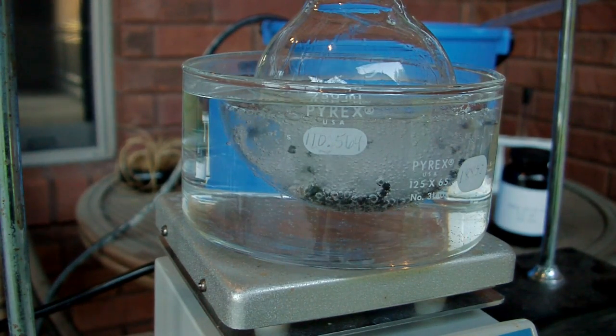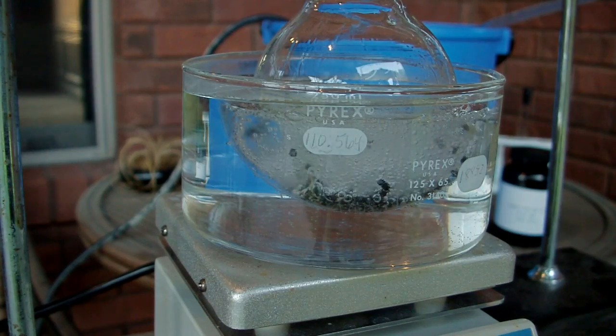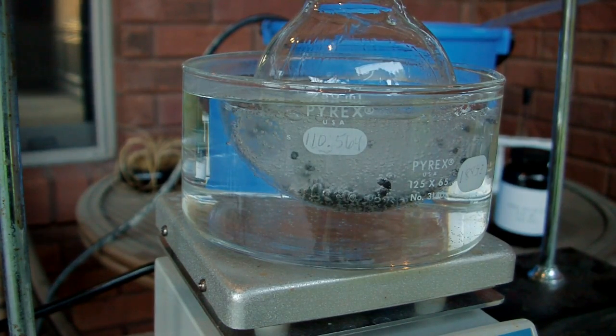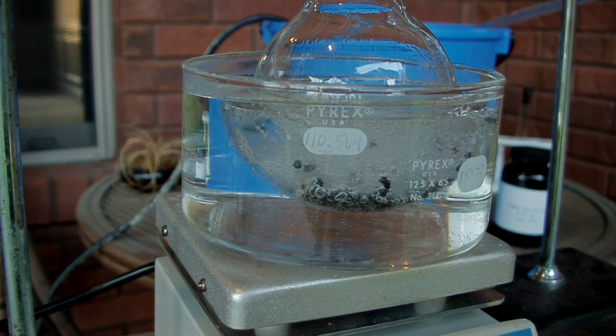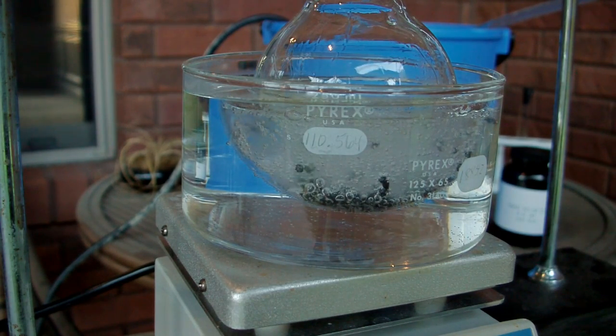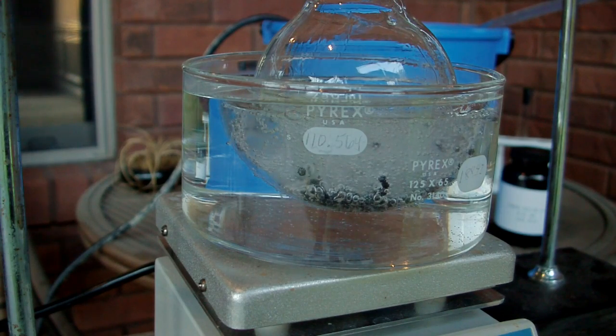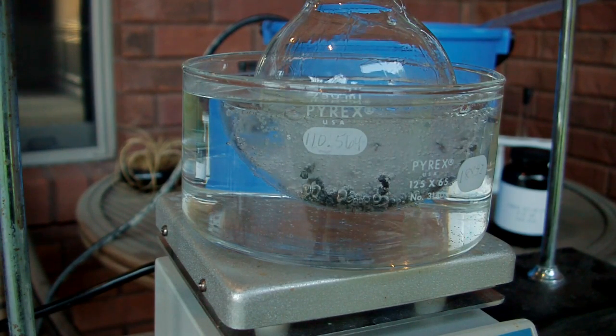Inevitably some methanol is going to come over as well. You can get rid of that by a second distillation. Take your product from this and distill it again and that should improve it a little bit. And again, if you have a fractionating column that's going to help.